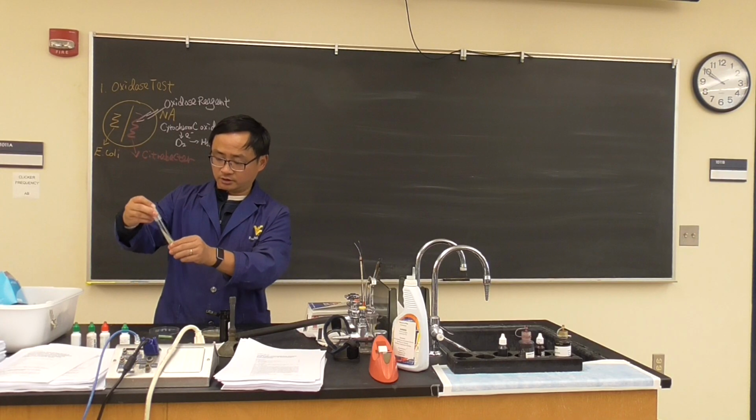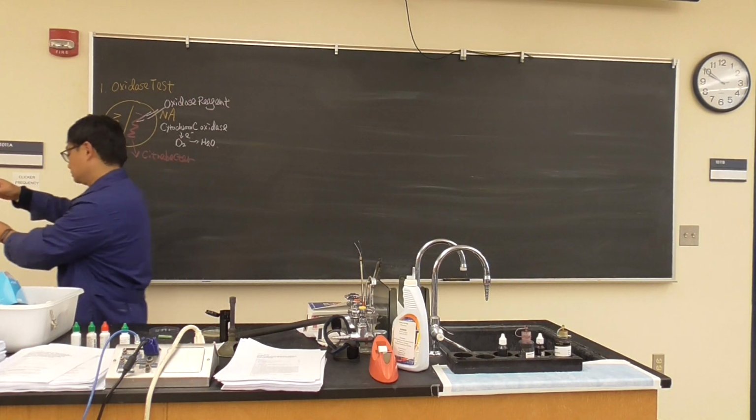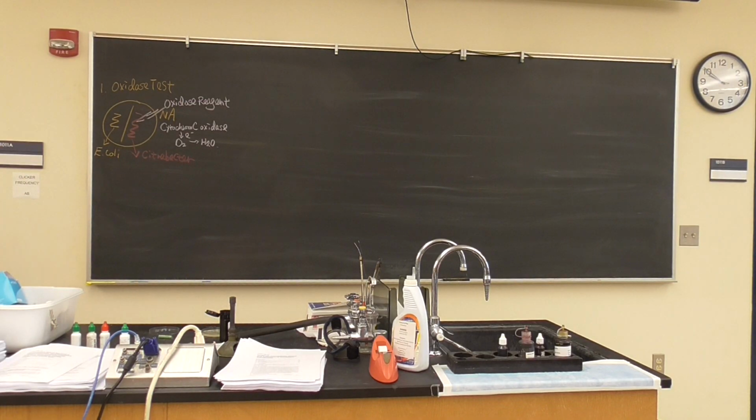Well, you can see Bacillus actually has some purple there. Very, very light. So I just want to show you, it doesn't mean too much.